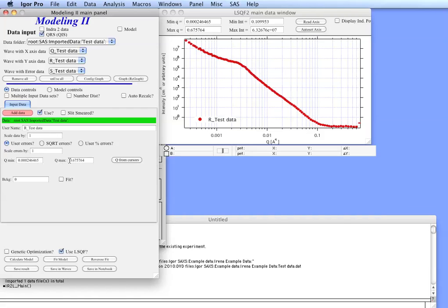This is Q-min and Q-max. These are the data which would be used for fitting and they are currently preset to the values of the first and last point. And this is the background.